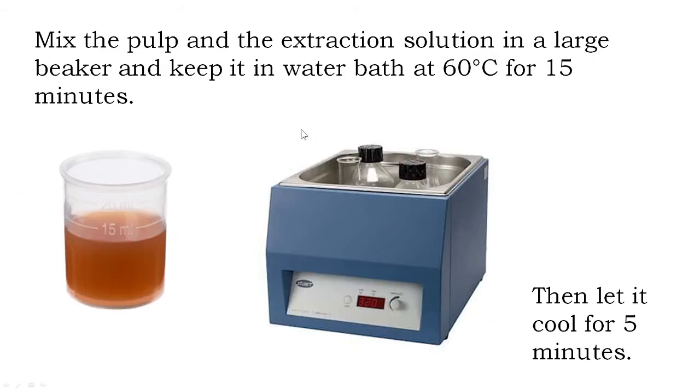After obtaining the pulp, you mix the pulp and the extraction solution in a large beaker and keep it in a water bath at around 60 degrees centigrade for about 15 minutes. Then you let it cool for 5 minutes.